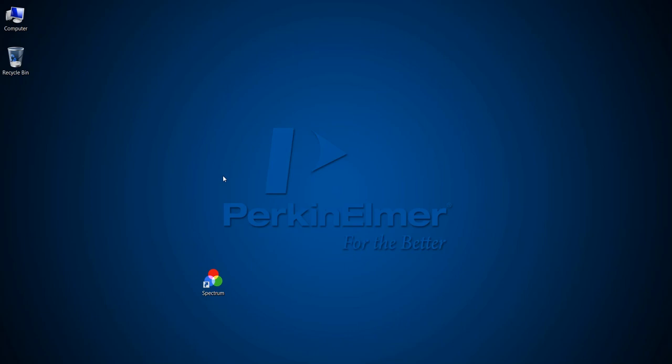If you have the Spectrum 10 software loaded on a PC, you will see an icon appearing similar to the Spectrum icon shown on the desktop. Double-click this icon to open the software.